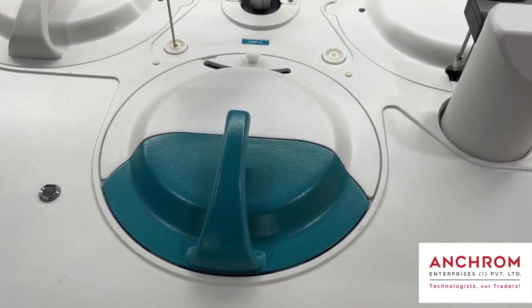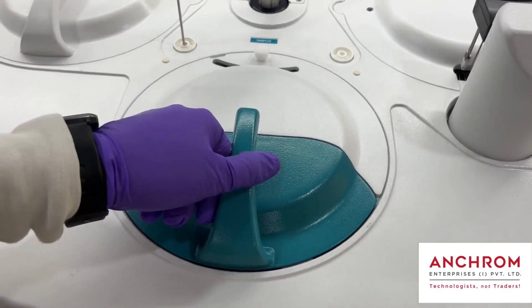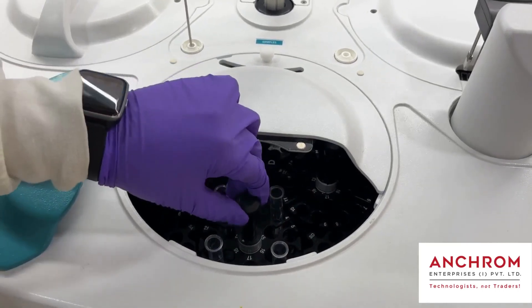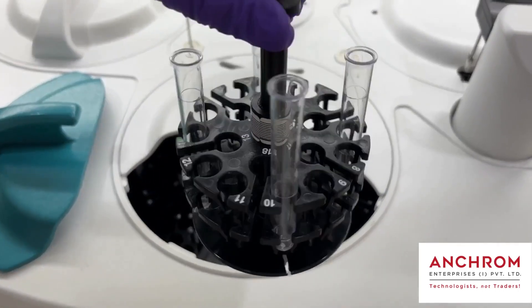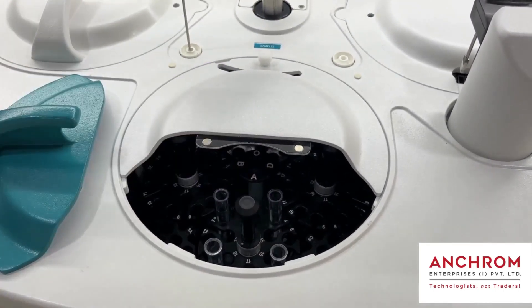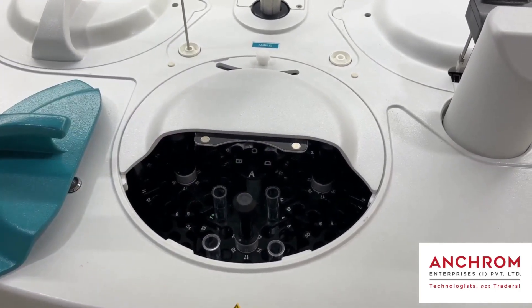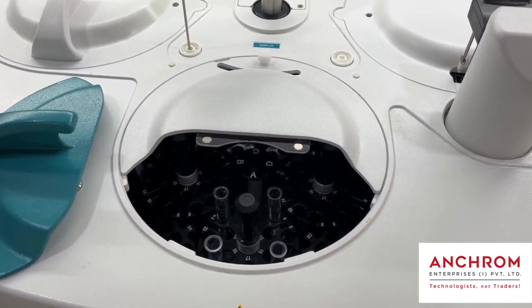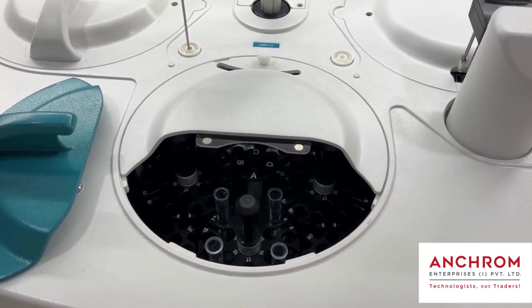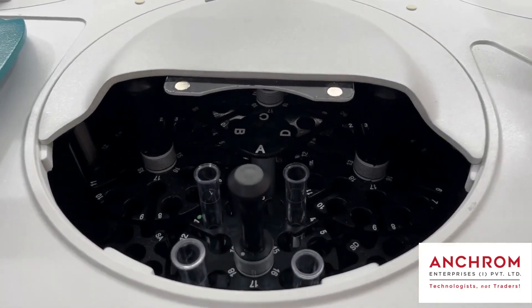This is the Sample Chamber where we load samples for analysis. You can see the Sample Rack, which can hold up to 100 samples at a time. SmartChem requires a very low sample volume of just 300 µL for analysis, so waste generation is also low, making it an environmentally friendly module. There is also a provision for continuous analysis without stopping the instrument.